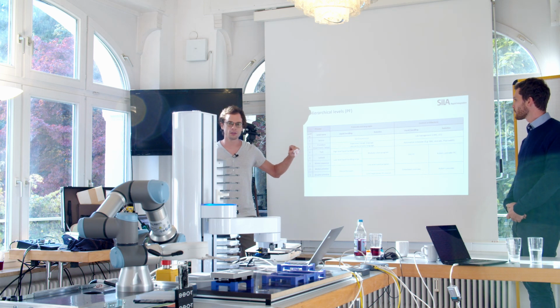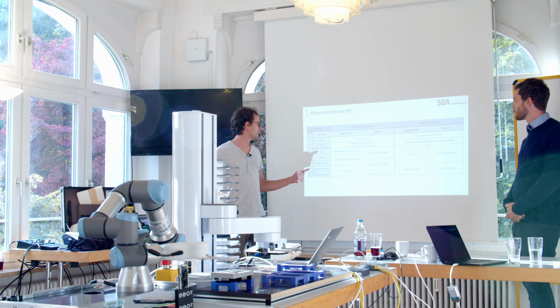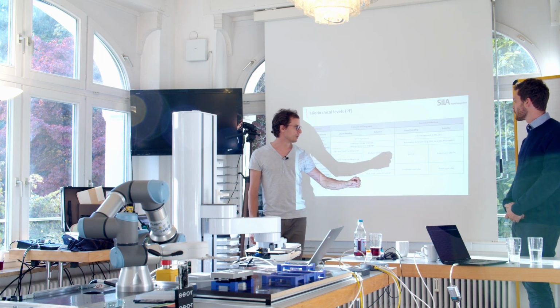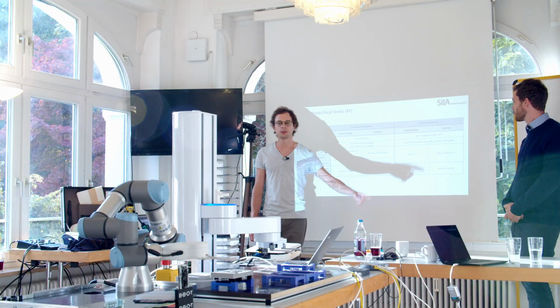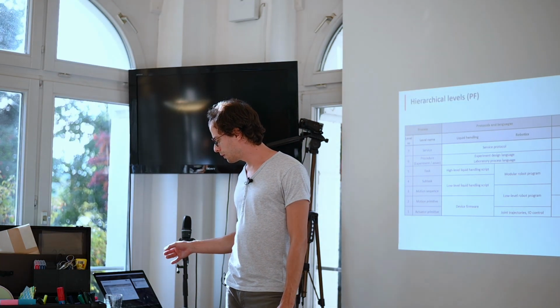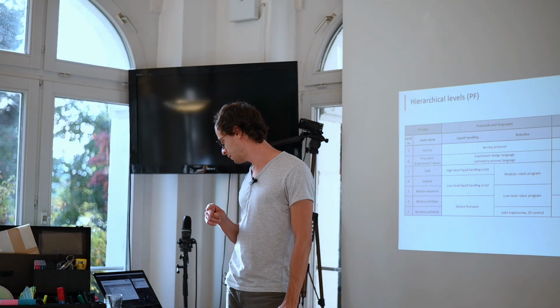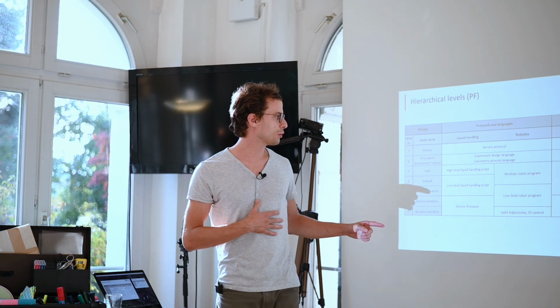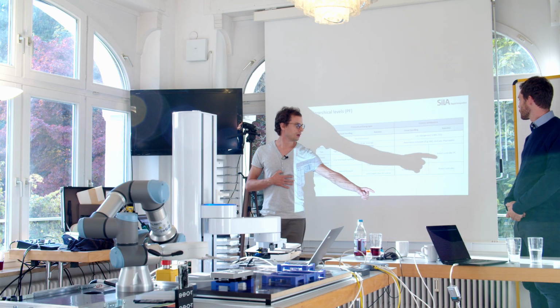So what we did during the hackathon, we addressed the task, subtask, and motion sequence level, and we implemented SiLA servers on the PC level for the robots. So that means that for the precise flex, we implemented also the motion sequences on the PC level.